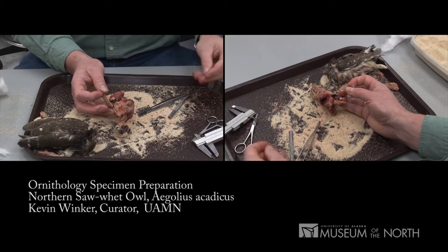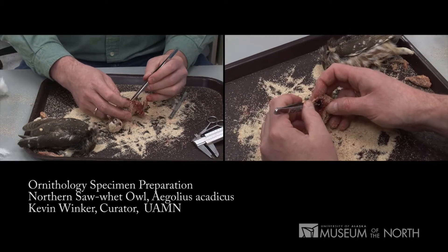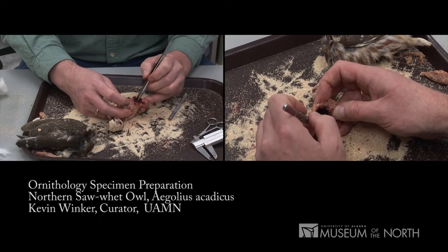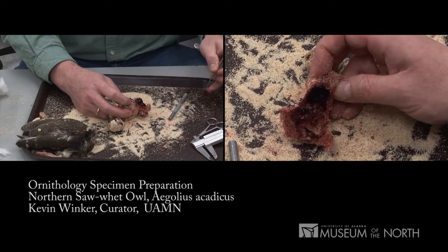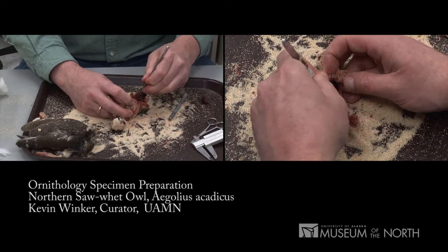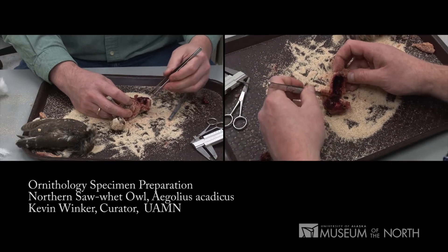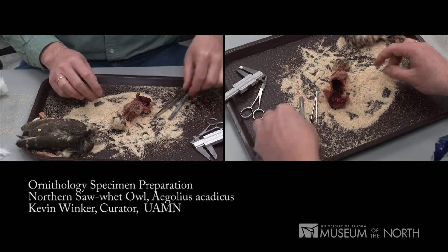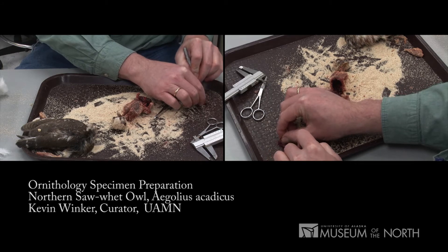I will take tissues so that we have high quality genetic samples from this bird. When we take tissues, we usually take several different types: heart, liver, and muscle are three common types. For smaller birds we'll take more. We put them into small cryogenic vials and store them at very low temperatures, usually about minus 80 degrees, minus 70 degrees, or even in liquid nitrogen.